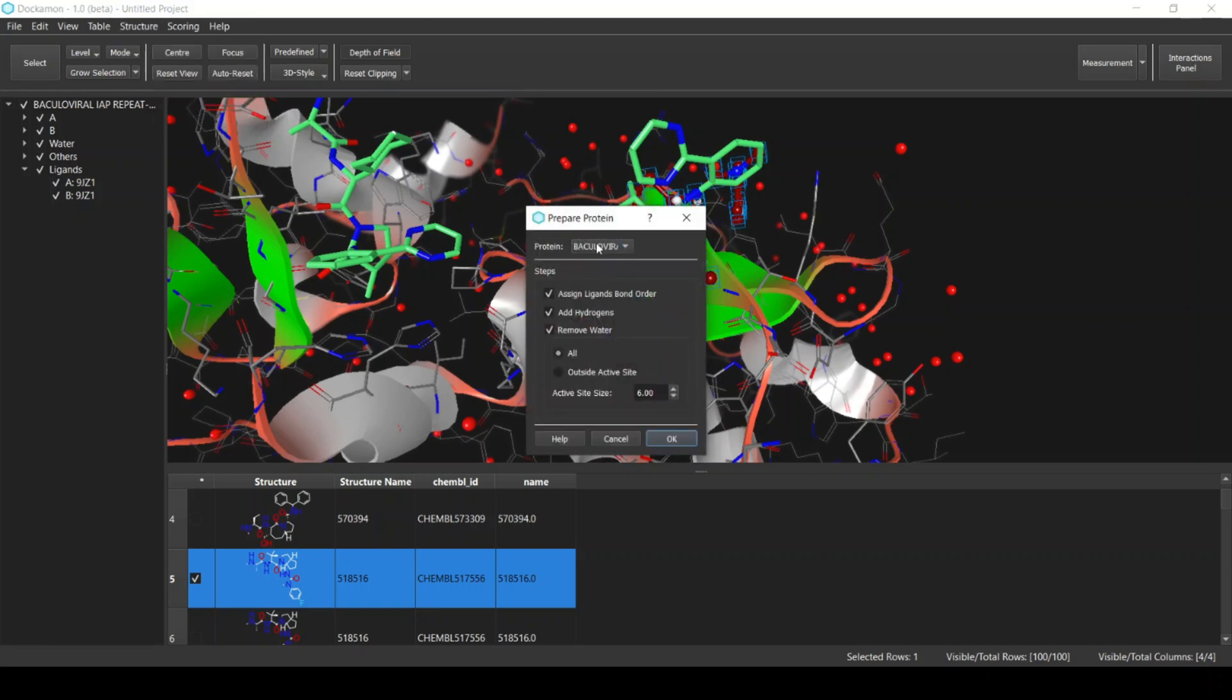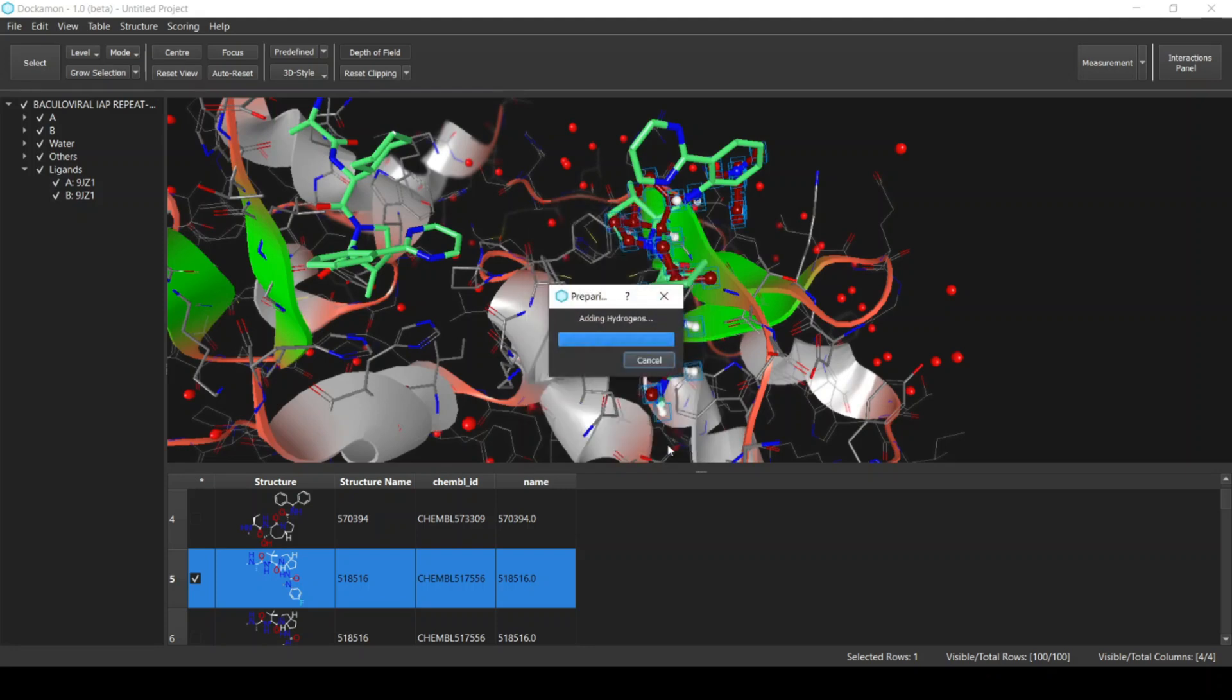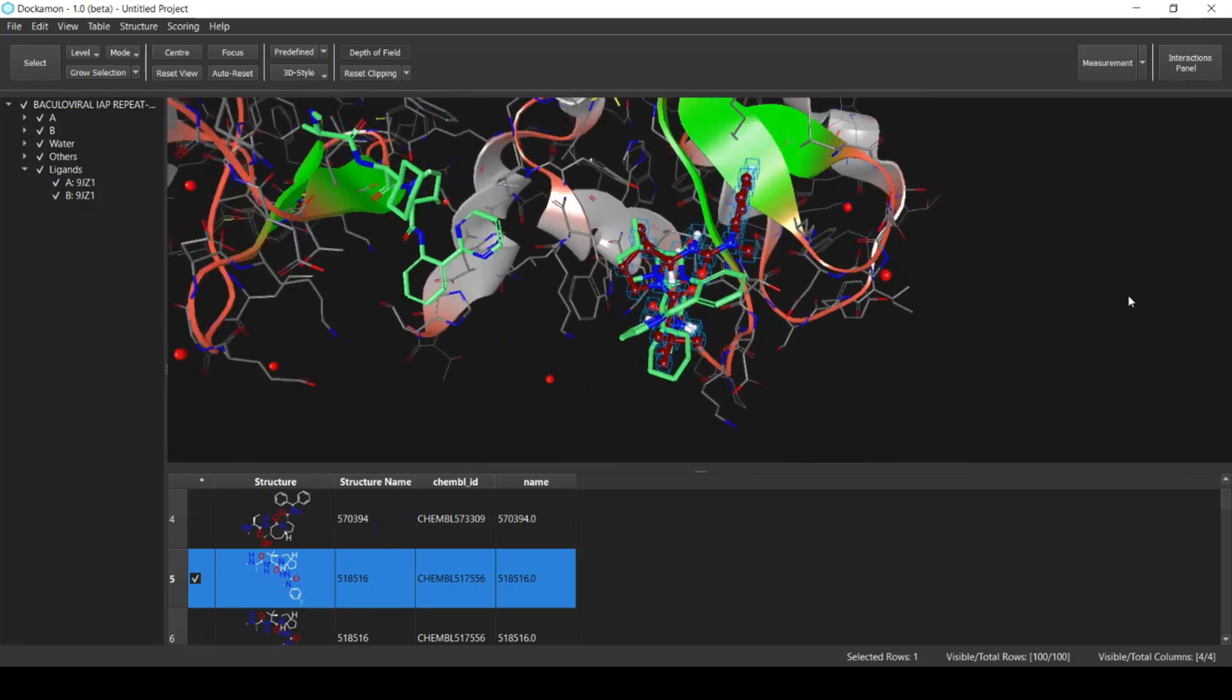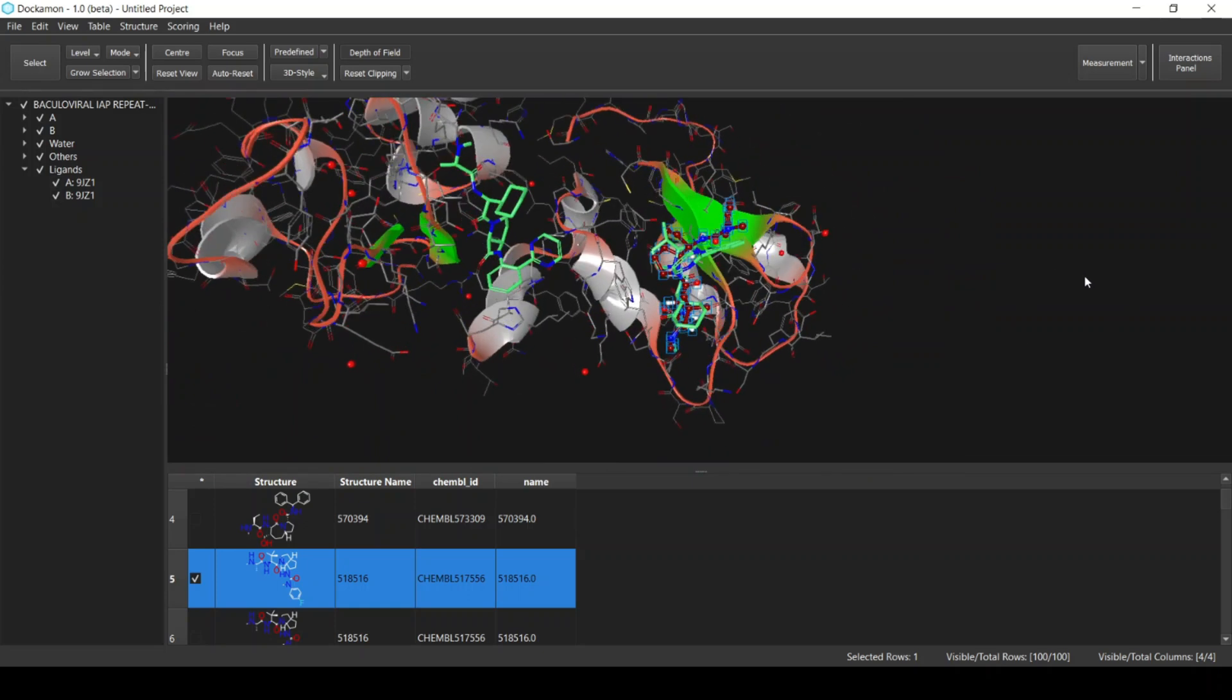Next we will prepare our target. From Structure, select Prepare Protein. From this dialog you can select the options. First of all, the name of the protein that we want to prepare, and also the preparation steps such as assigning ligands bond order and adding hydrogen atoms. We will remove water that is outside the active site. Then click OK, and the target has been prepared successfully.